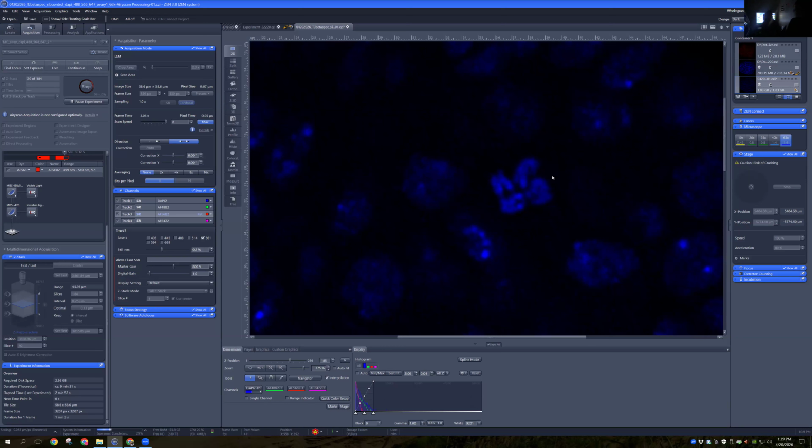I did notice right before that gorgeous composite image came up that Raja asked, will the division be meiosis or mitosis? That's a great question. So these PGCs, these primordial germ cells, are still in this progenitor state, hence their name. They are not yet germline stem cells. And so they are dividing symmetrically and undergoing mitosis. They are just doing the same normal divisions that all of the typical cells in your body or in the Drosophila do. They are not doing the specialized reductive division that is meiosis.